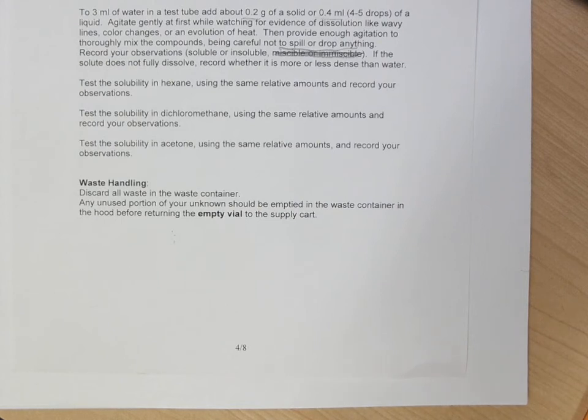But that's essentially an overview of the lab. We're going to observe what things look like, just looking at them, the observations of state of matter and color and clarity, and anything else that's noteworthy. Then we're going to try to burn a few things, which is always exciting. Some things burn, some things don't. And then we're going to try to dissolve a bunch of compounds in different solvents so we can get an idea of the solubility properties.